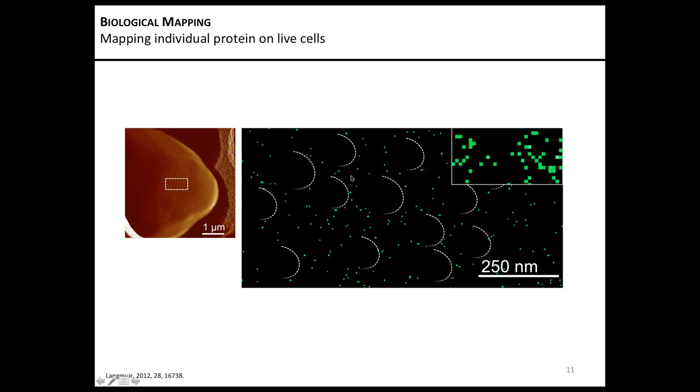Rather, in PeakForce, you can see that, for example, here the proteins seem to be organized like a network with some space where the proteins are not. And we believe that this organization reflects the organization of the proteins in the plasma membrane, where the sensors are excluded from nanodomains. And so we can start to say something about the organization.